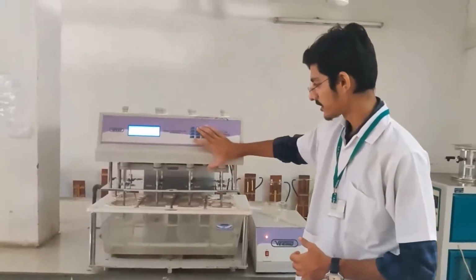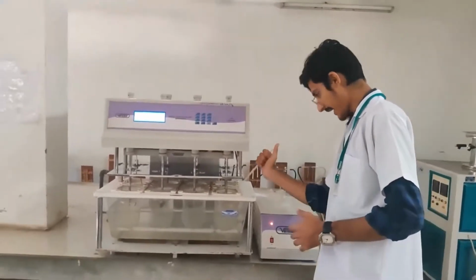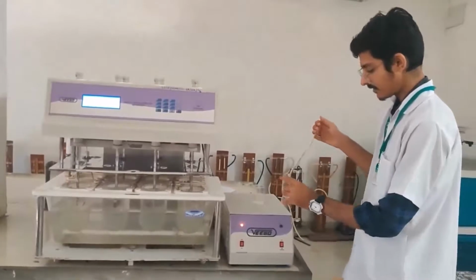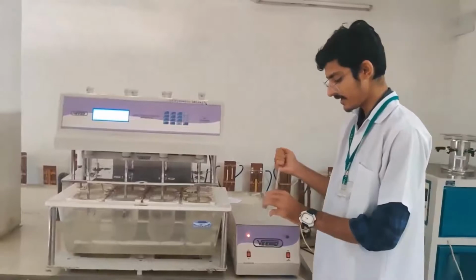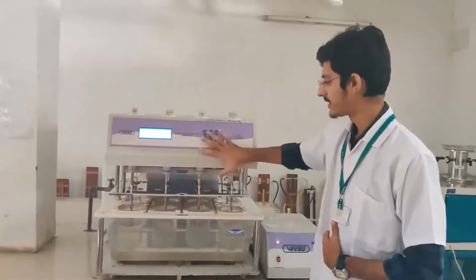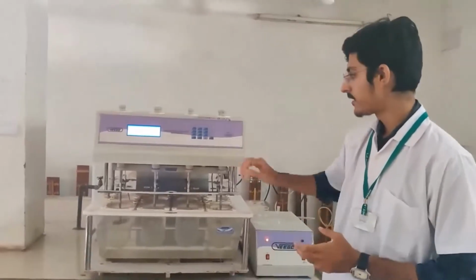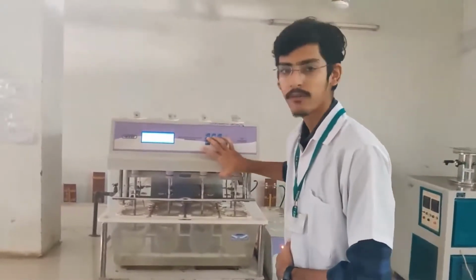Now, we will stop the stirrer and withdraw the sample according to the time specified in the monograph. The same amount as the withdrawn sample will be added as fresh dissolution media to maintain the same condition. Again, start the stirrer and repeat the same procedure till the last one. After the last endpoint, stop the stirrer and lift the platform by pressing the platform button.